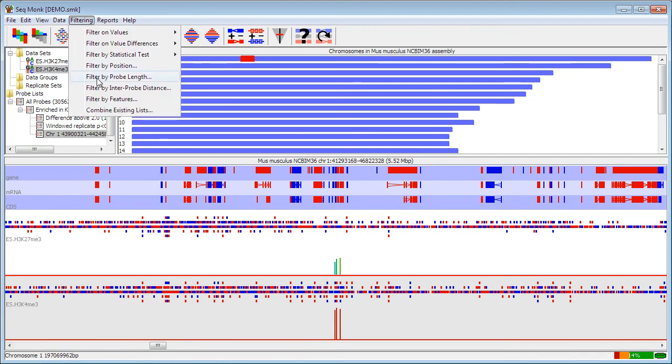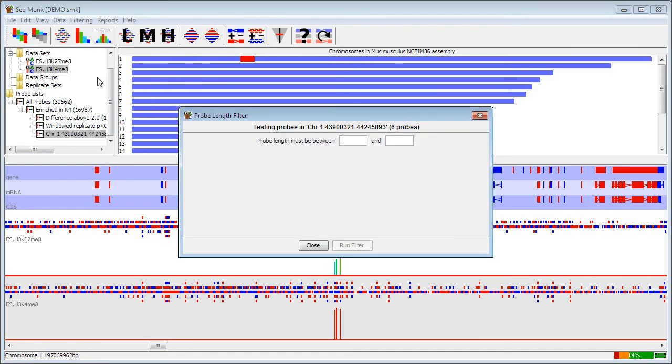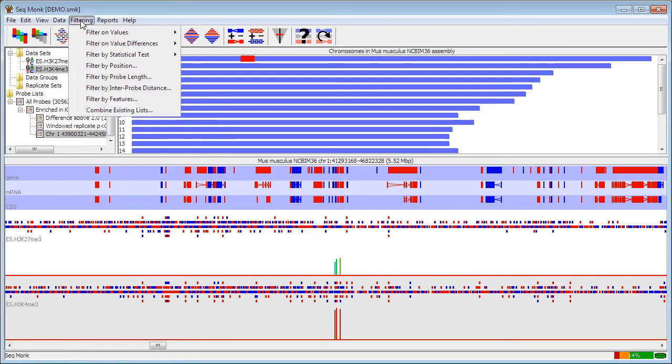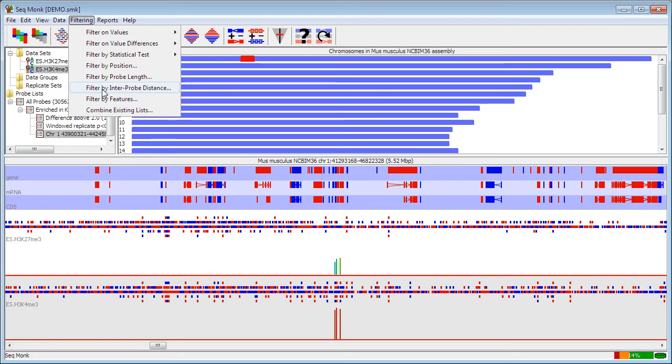Other things that are useful in here, filtering by probe length. If you've done a probe generation, which has generated probes of different lengths, so for instance, putting a probe over every gene, you can then subsequently filter those by length. It's very simple. You just specify an upper and lower length limit, and then it will filter probes within that set. Filtering by interprobe distance can be useful if you're looking for either periodicity in your data, so you're specifically interested in probes separated by a certain distance or range of distances. It can also be used to find probes which are isolated or probes which occur in a cluster, depending on how you apply it.